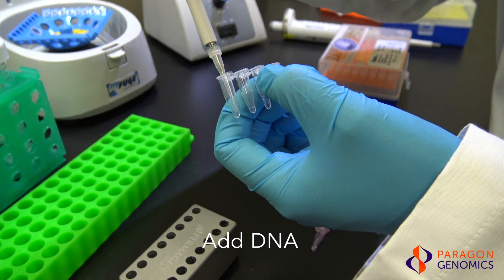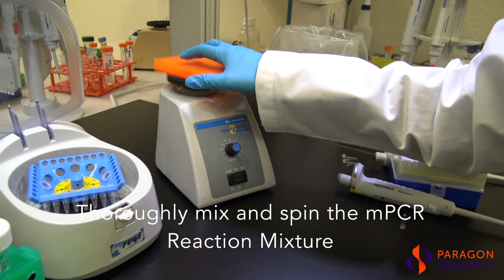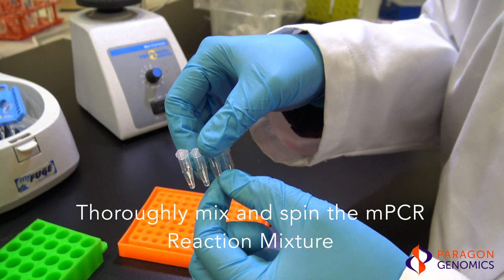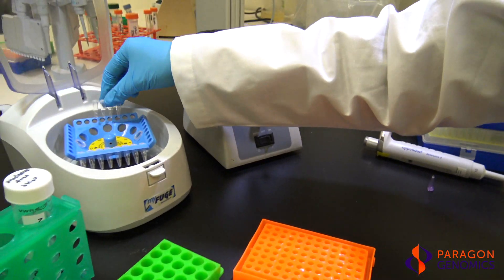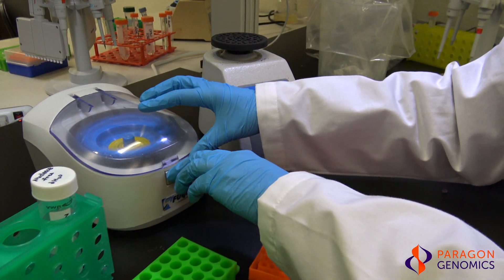The total volume of the mixture should be 10 microliters in each tube. Mix the reaction thoroughly, either by vortexing or pipette mixing. It's critical to ensure that the reaction mixture is homogeneous prior to PCR. Quickly spin down the mixture to collect it at the bottom of the tubes. The reaction mixture is now ready — proceed immediately to running the multiplex PCR reaction.